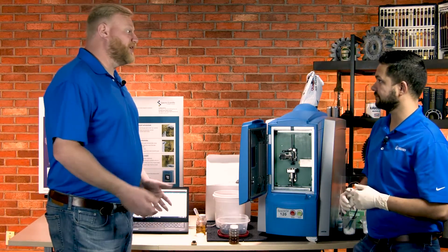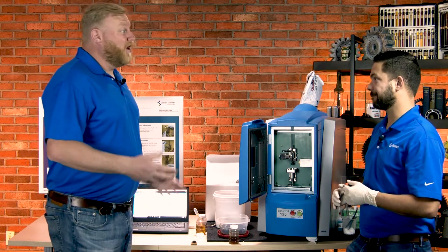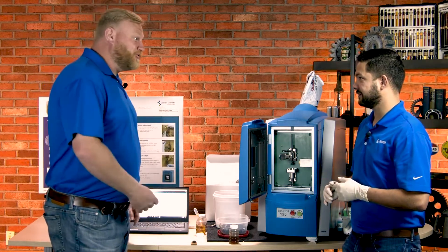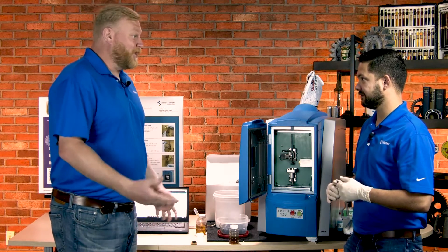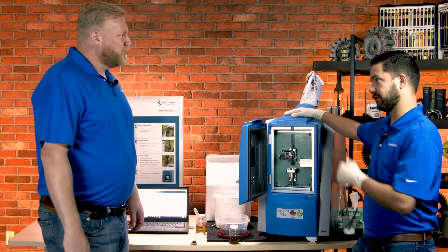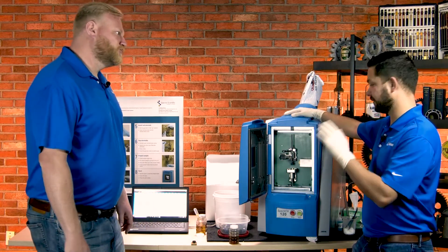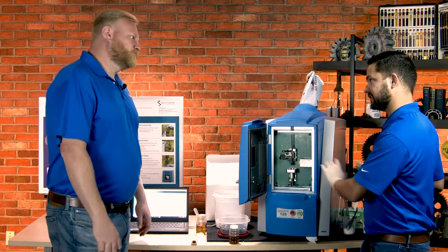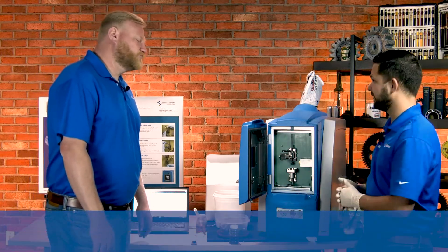I've utilized technology from these guys before on-site. What I like about this is the option to use it from a commercial laboratory as well as the possibility of using it for an on-site oil analysis lab. It's something anyone would recognize from their oil analysis reports, but it can easily be used on-site. It's not very difficult to set up, and once you get going, it's not a problem at all.